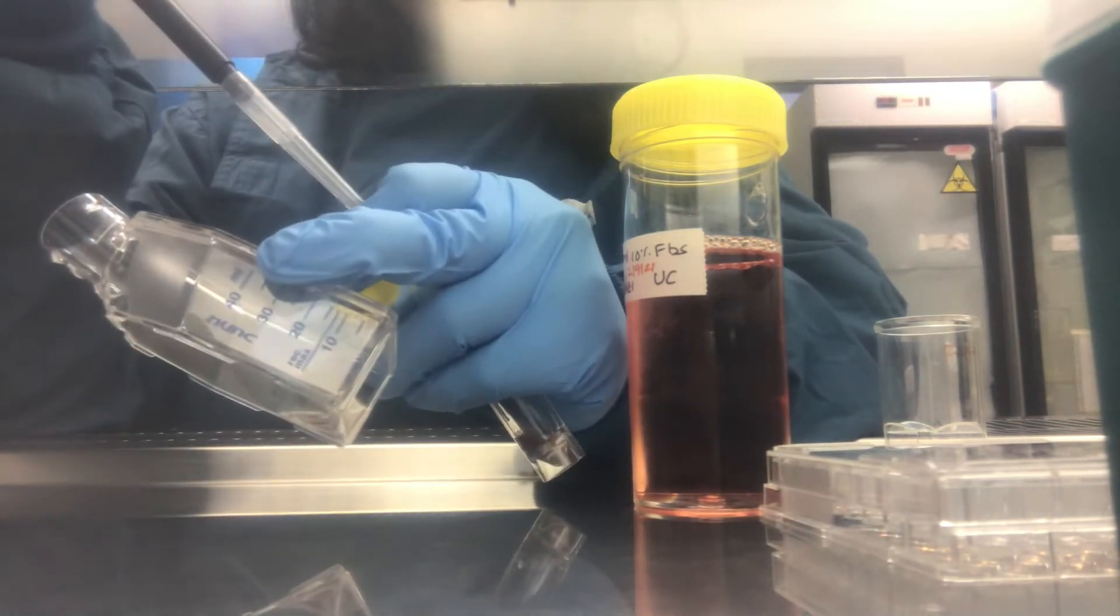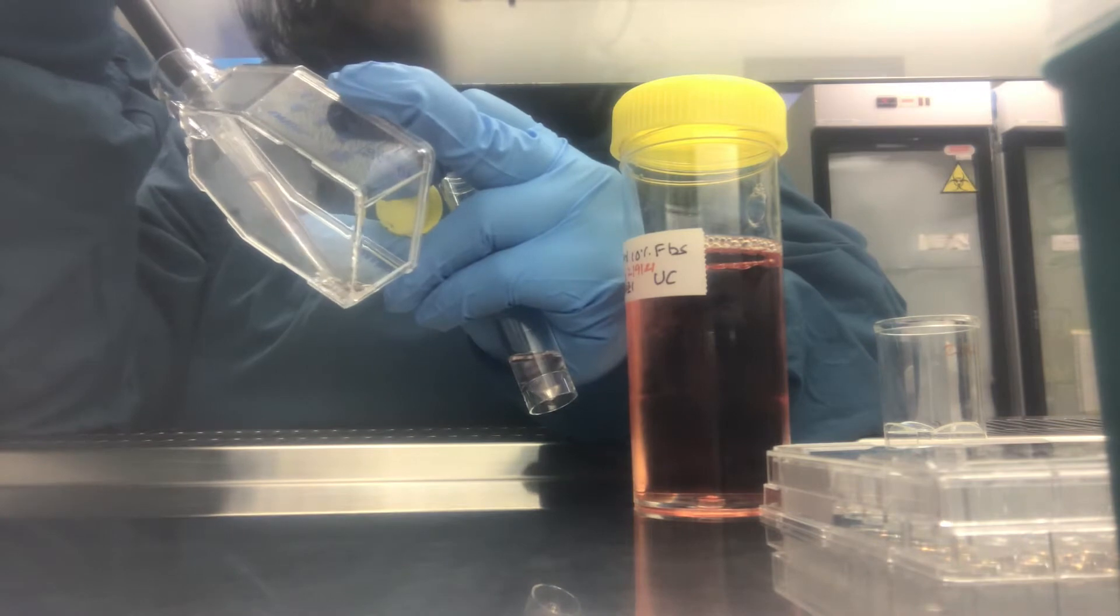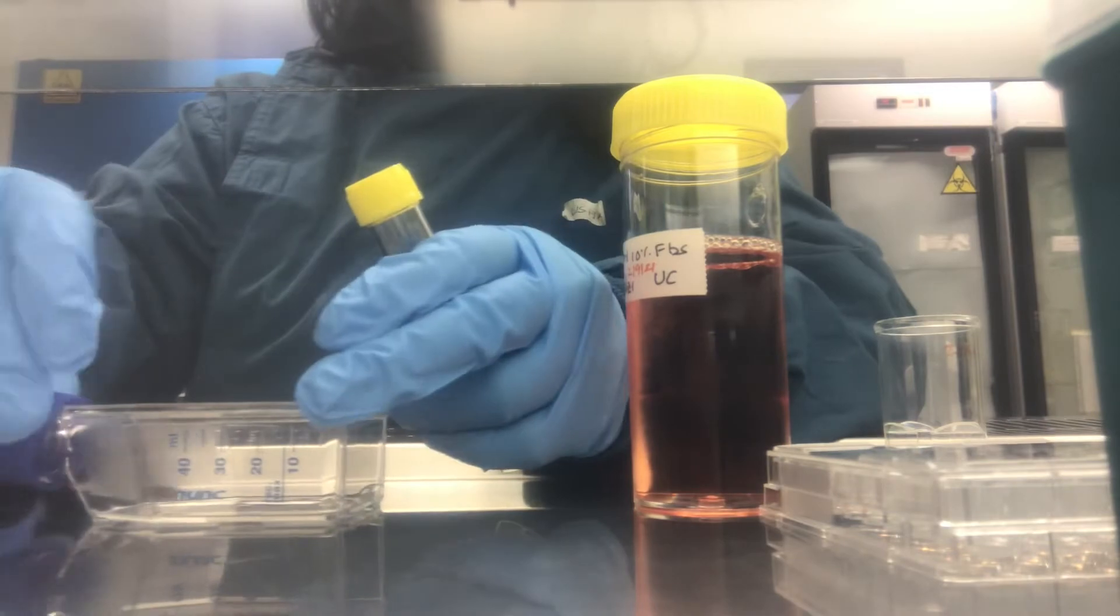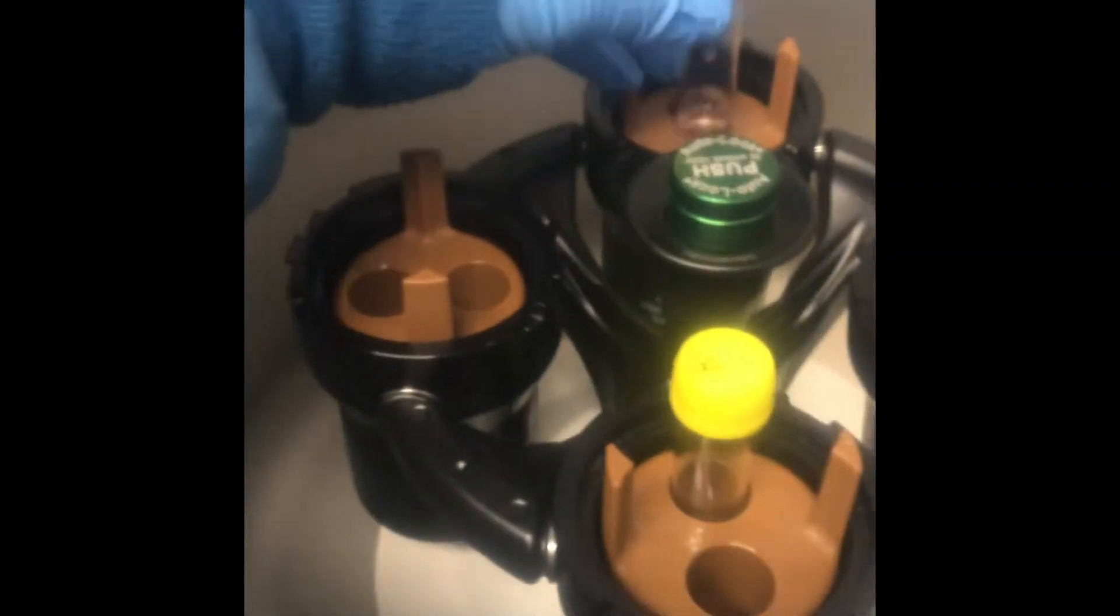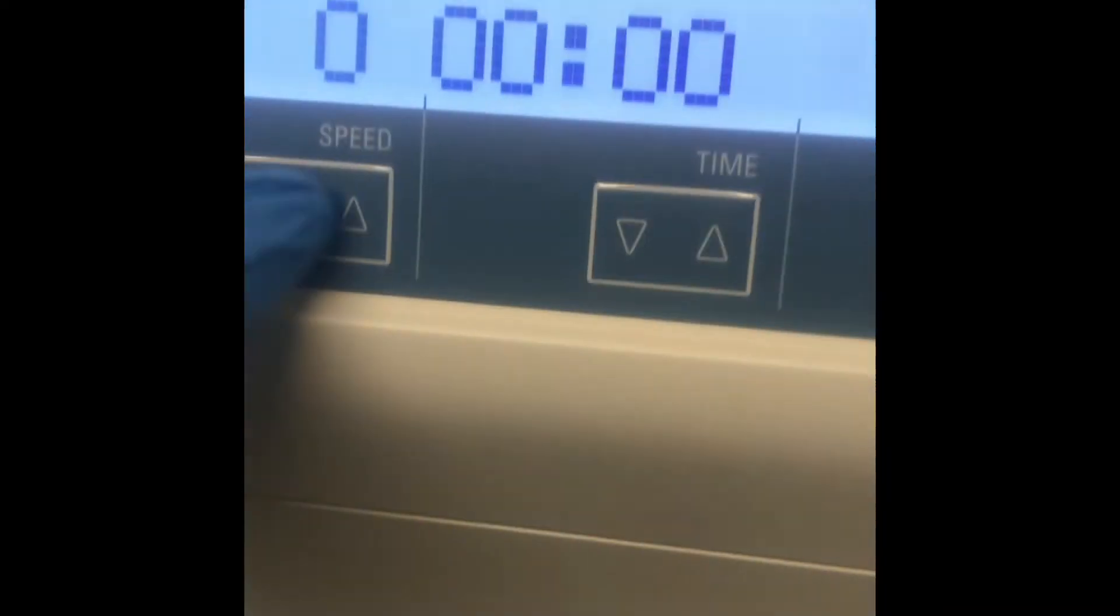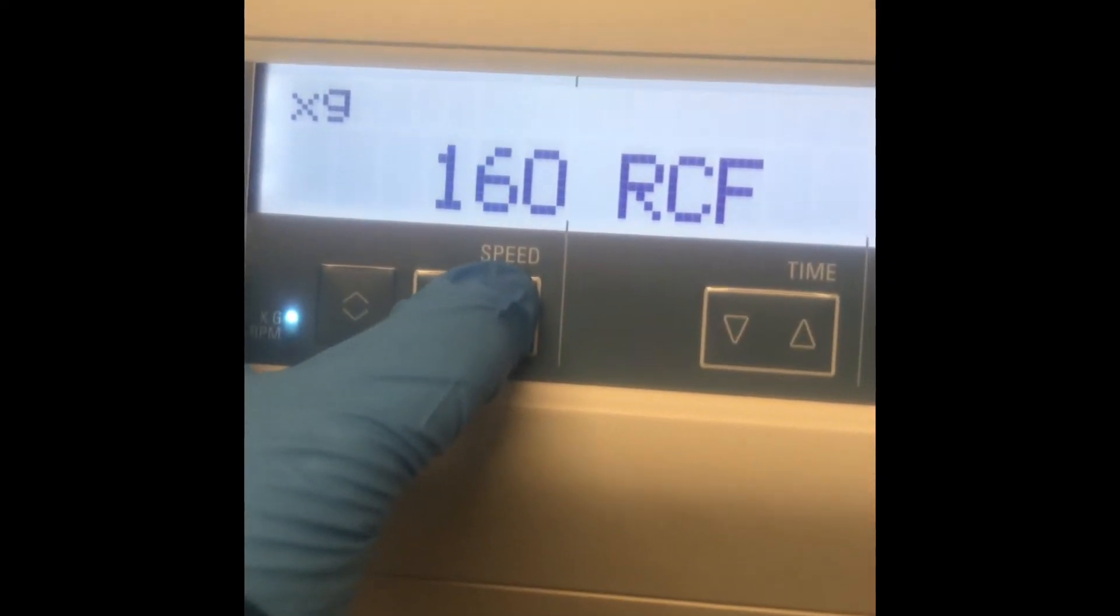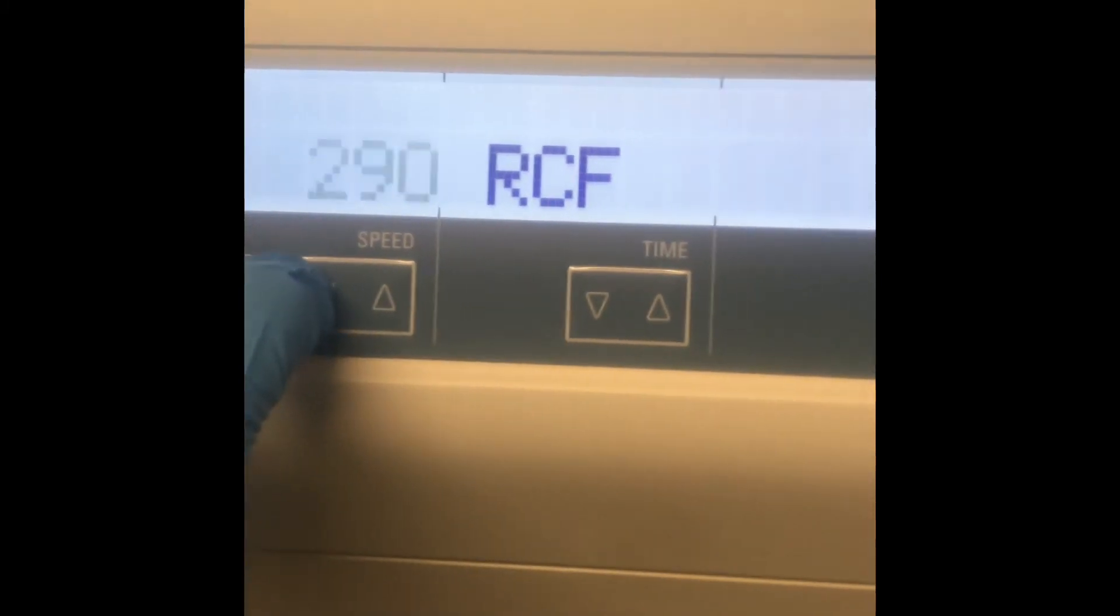The centrifuge I'm using is at 1100 RCF, and you can change according to your cell type. I'm just putting it for four minutes and wait for the pellet.